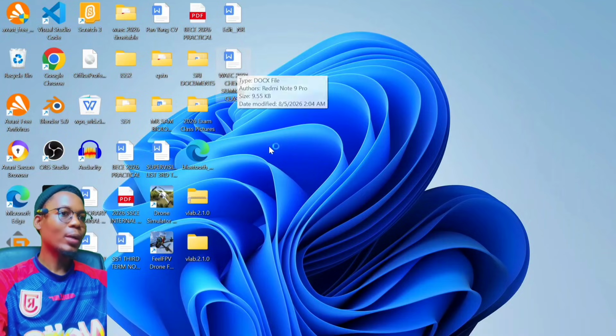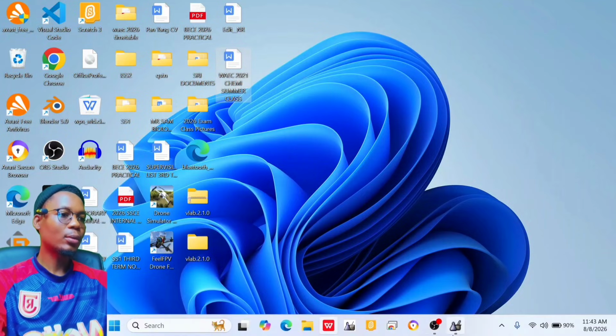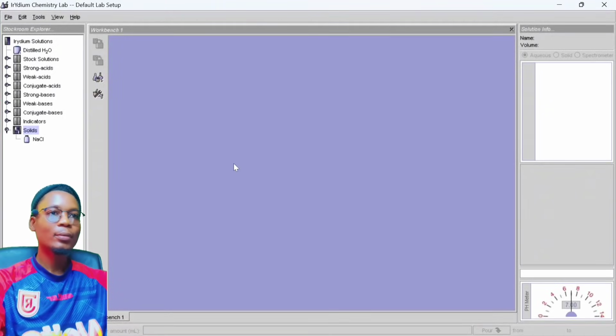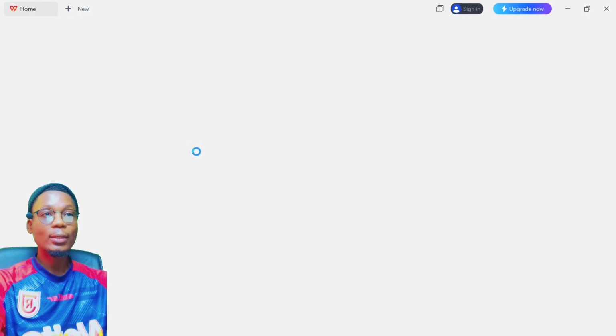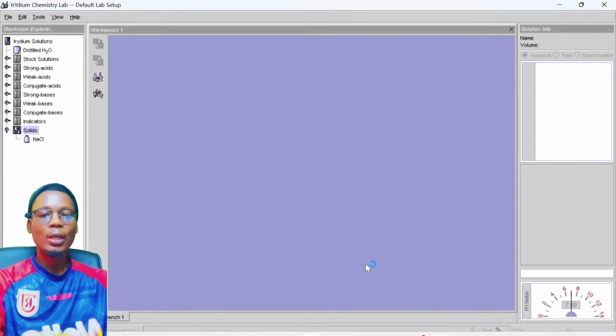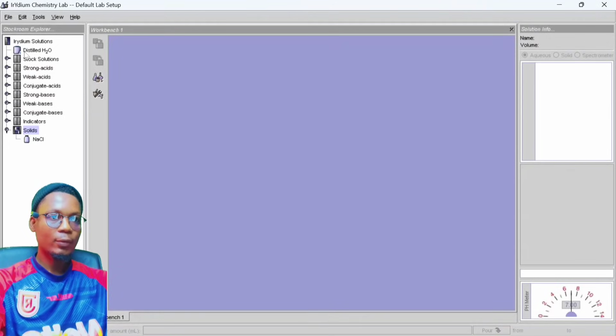So, okay, why is it loading? I don't know why it's delaying. So let me go back to my chemistry app. Okay, it's already opening. So let me go back to my chemistry app. I will get the things I need for my titration.